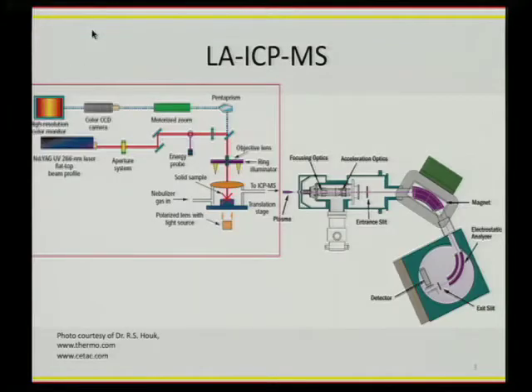So this is my instrument. The portion highlighted in red is our laser, and it's a schematic of our nanosecond laser. I have a schematic of our femtosecond laser, but for the sake of time, I'm not going to go through the nitty-gritty details of all of this. So please come see me if you'd like to see that femtosecond laser schematic.